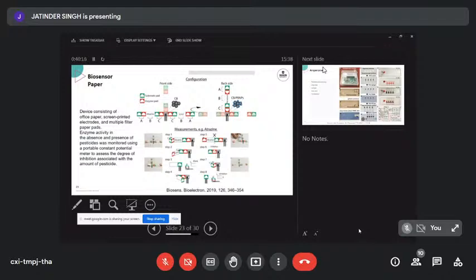So this is a paper fluidic device that absorbs the analytes and, in a very well-defined, well-confined environment, gets the enzyme and the substrate folded on top of the electrodes. But we'll have a whole session on paper fluidics, and I'm convincing Professor Malik that we can actually do some making of paper fluidic devices ourselves as well.